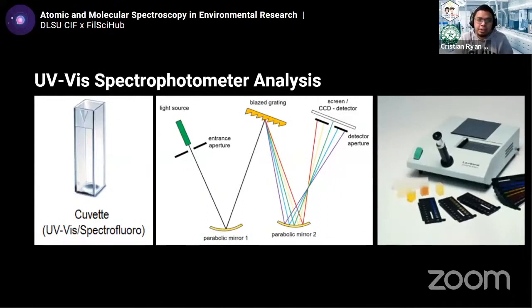One important thing we need to know about the sample container, which is this one, is that it must be apt for the spectral region of interest. For example, quartz is okay to use as a material. It's expensive, but it's okay whether you use UV or visible region because it doesn't absorb those wavelengths. So quartz is good.